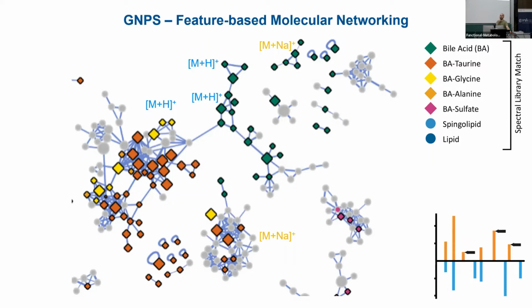To this graph, is there any reason how they organize the nodes, if they're not connected to each other? Is there any chemical nature behind it? So it's just white space and they put nodes somewhere. Yeah. If there's no connection, we usually do it in Cytoscape. It's a very nice tool for graphical visualization of networks and graphs. But it's usually just a force-directed graph. So if there's no edge between them, there's no force, so they're just going to disperse.